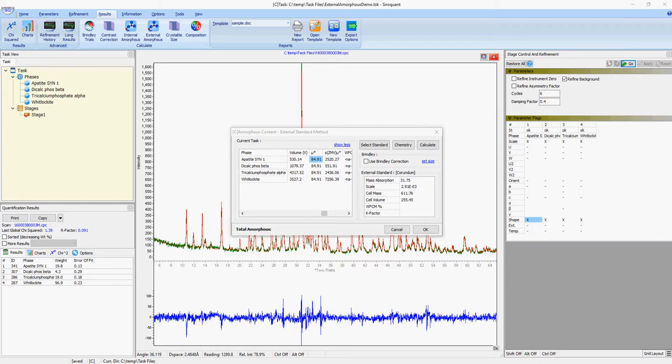The next step is to enter the amorphous content for the standard. In this case, we know that the standard has an amorphous content of 1%, so the WFCM is entered as 99%.